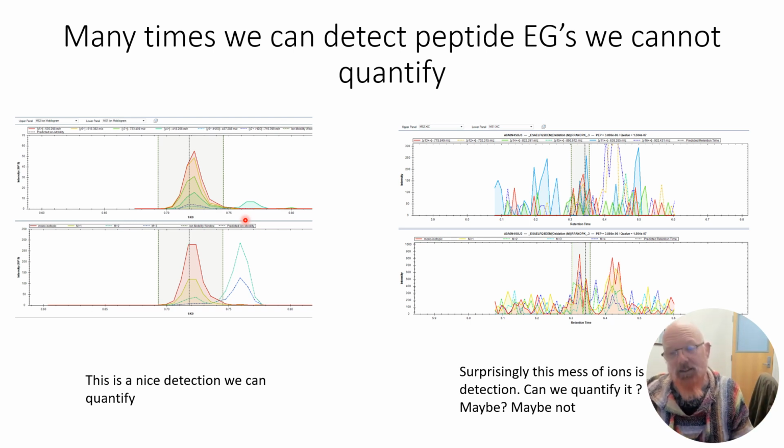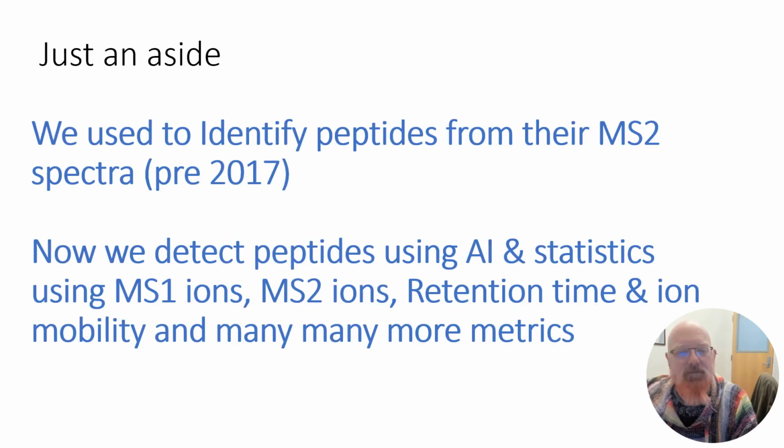Is it going to really add much to it? Maybe not. Maybe if we have 15 or 20 of these, it could. So even if they look kind of crappy, they may not add to the overall noise of your protein group quantitation, I think.